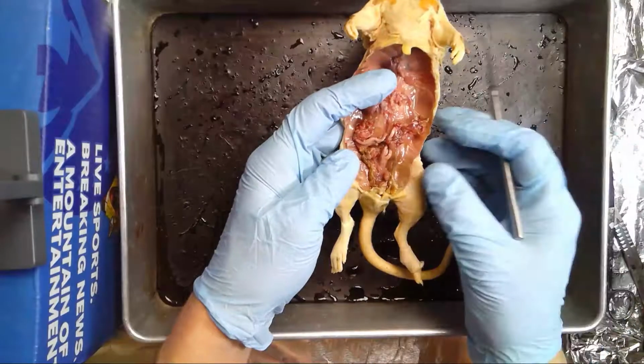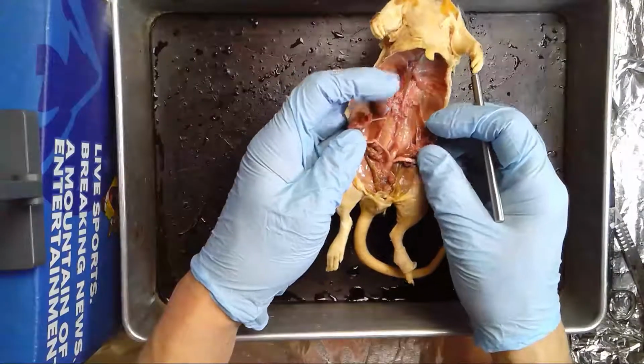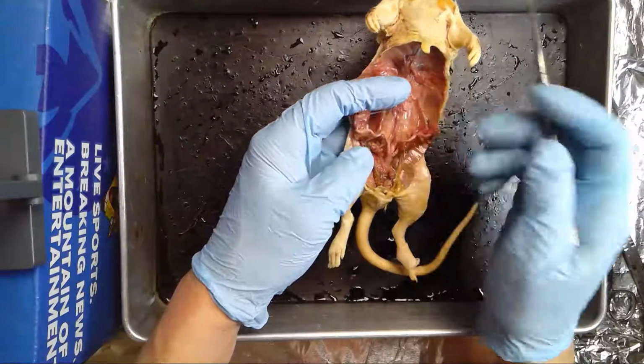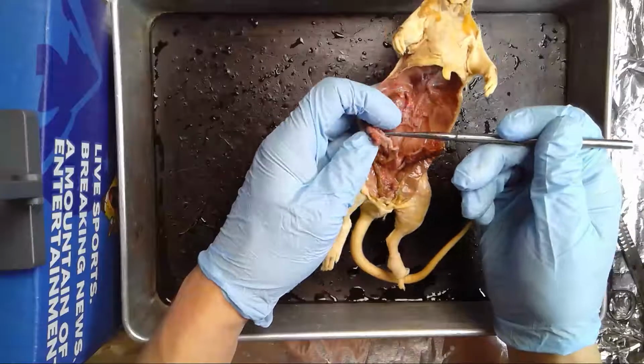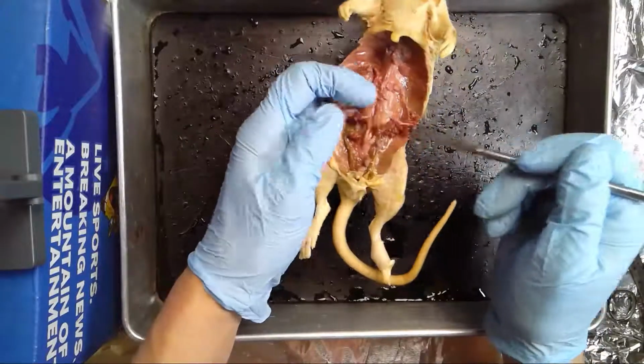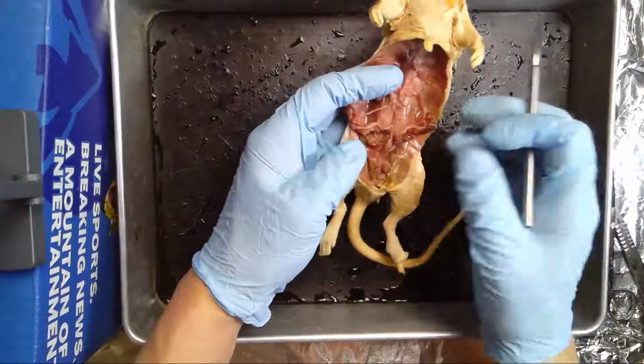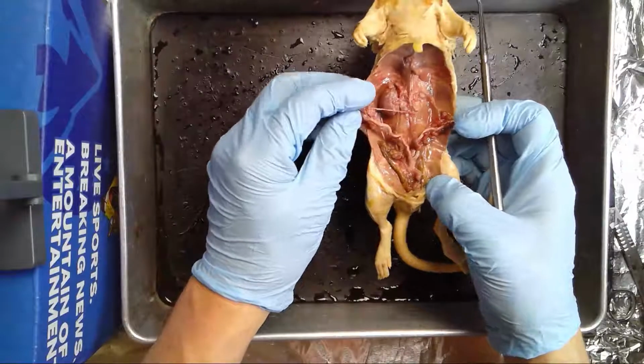One other thing. Some of the female rats are actually pregnant, and so if you look at the uterine horns, you'll see these bumps. So you can actually dissect into that, remove what's inside, and you'll find a placenta and a fetus, and so forth.